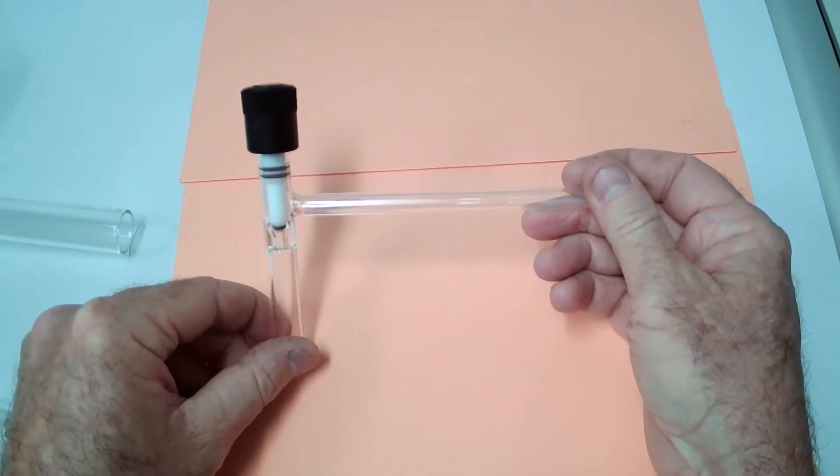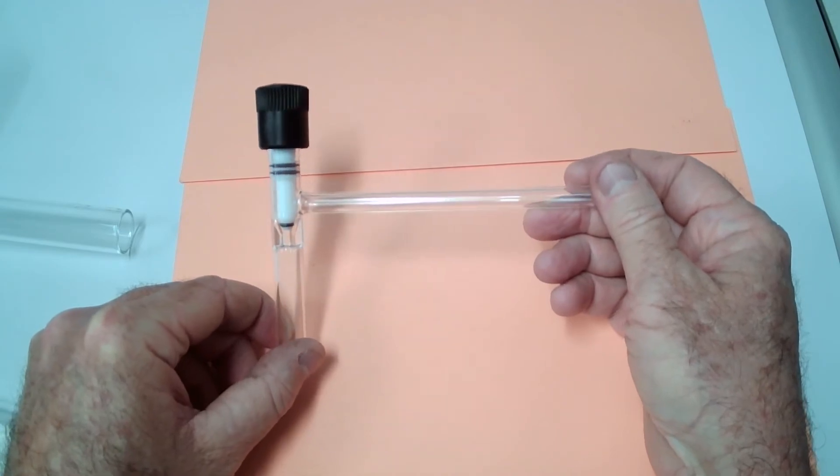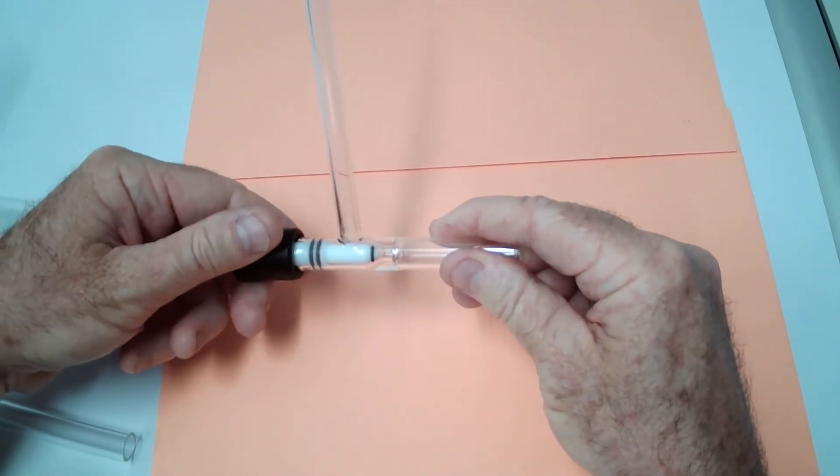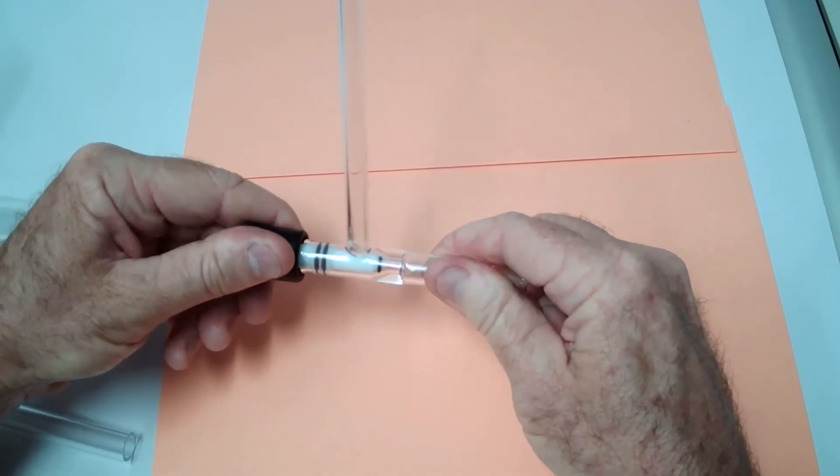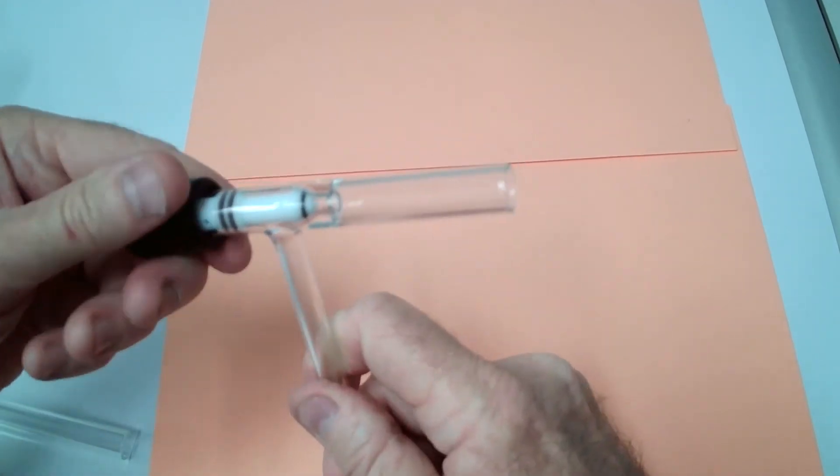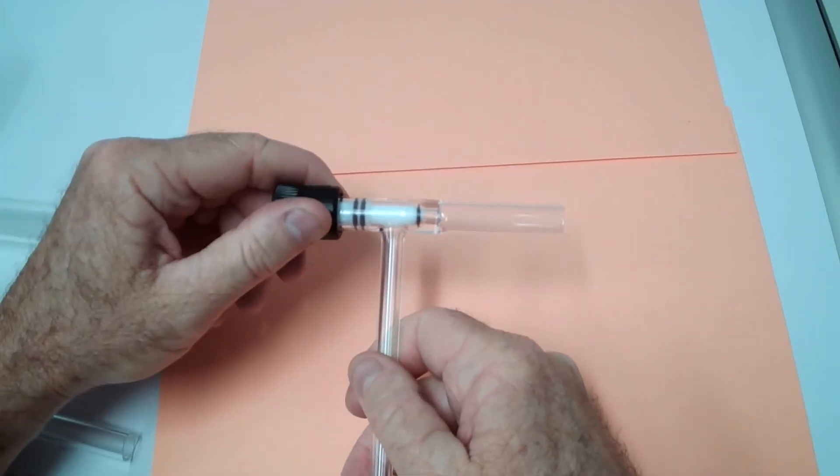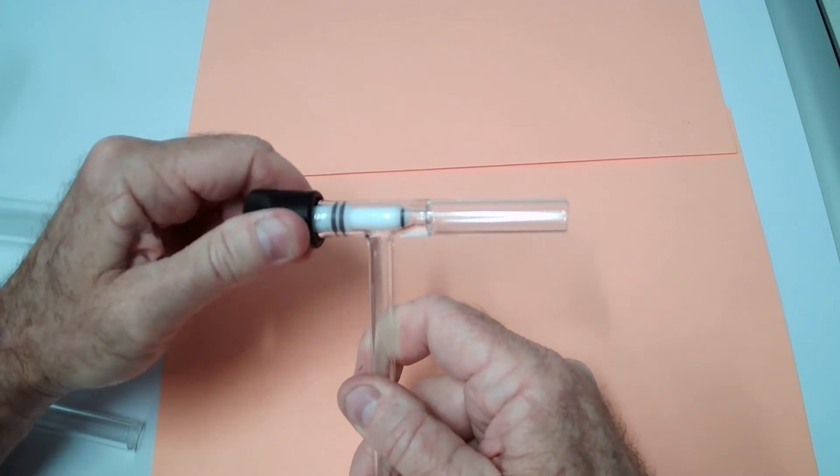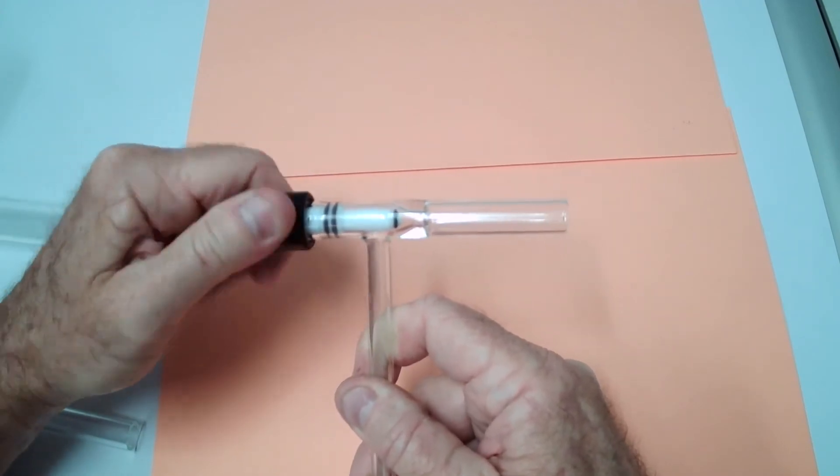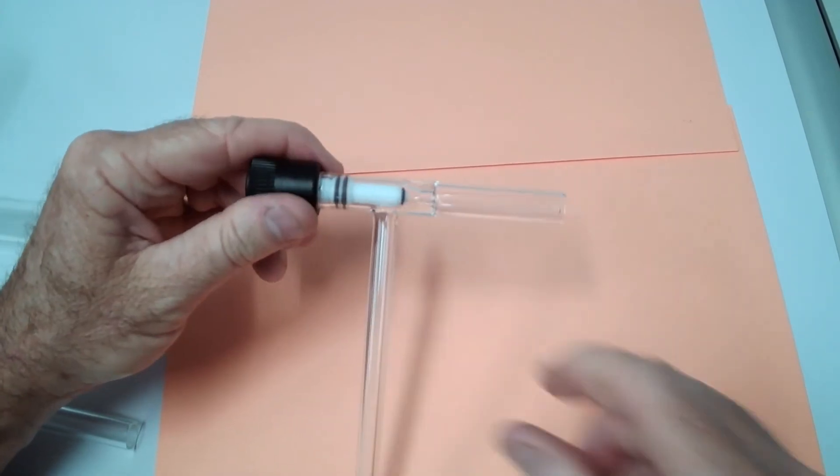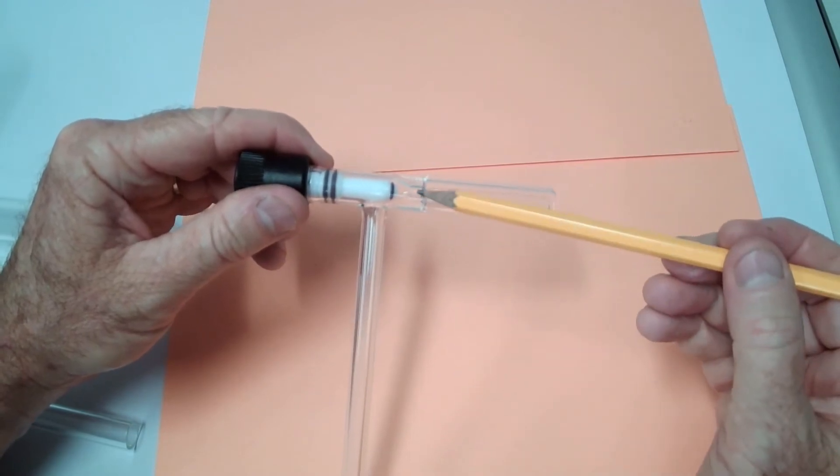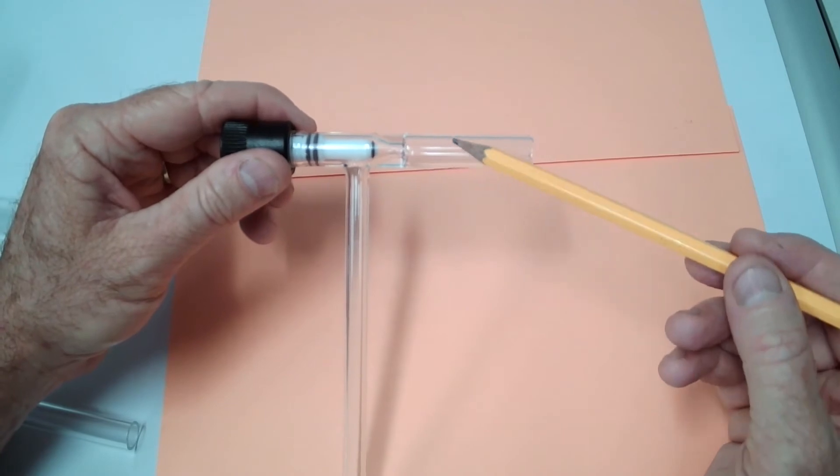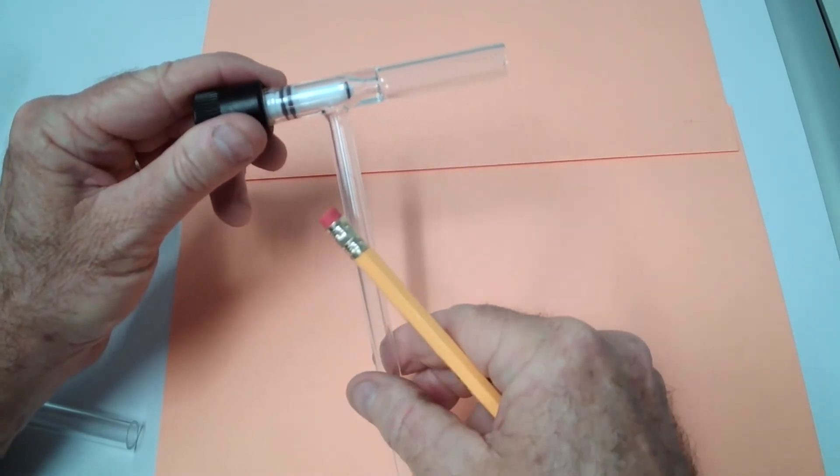This is a zero to four high vacuum valve. The zero to four refers to the minimum and maximum opening of the valve. Completely closed to zero, and it varies as you open it up to the maximum opening, which is the opening of the valve seat. In this case, that is four millimeters. So this is a zero to four high vacuum valve.